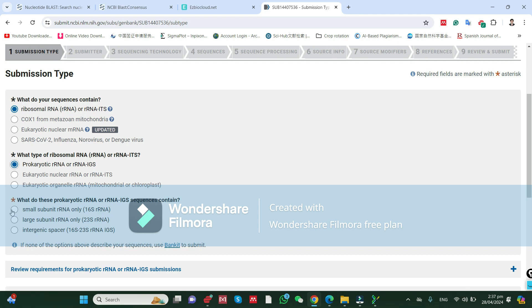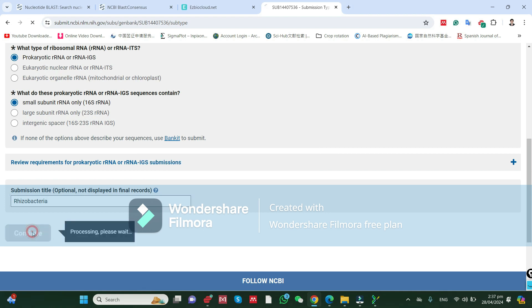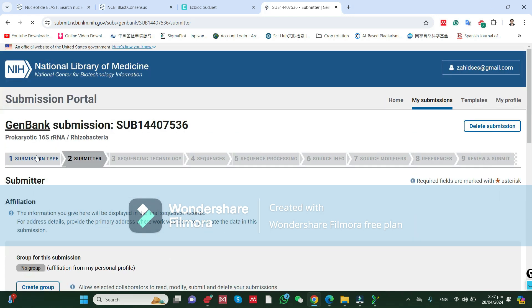If you are working with plant and fungi you can click on that option. I have small subunit RNA which is the 16S rRNA, so click on it. You can give a submission ID — you can write anything here. For example, you can write a sample name such as bacteria, human urine, or any other sample description.